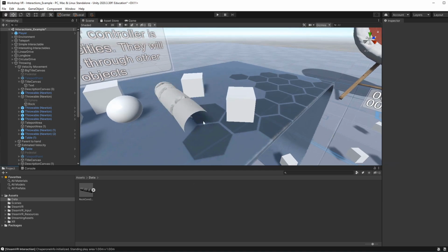All right, so let's try to solve these missing triangles from our model. If you remember from when I was talking about the surface view in Avizo, this problem comes from the fact that the standard shader in Unity culls away the back-facing triangles for optimization purposes. So what we want to do to solve this is to disable this back-face culling in Unity.